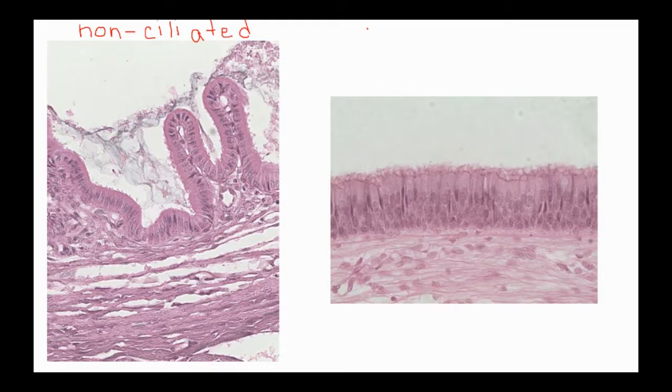It's real tough when I have to write. Non-ciliated. Over here on the right, we have ciliated.